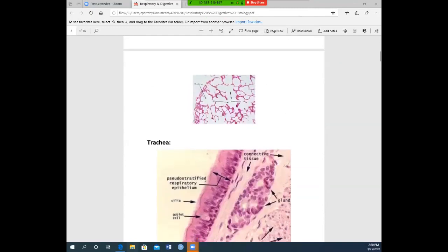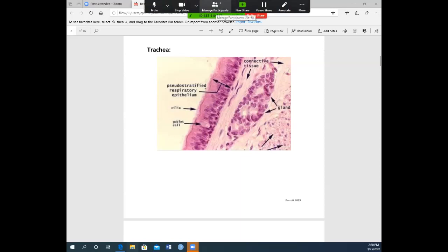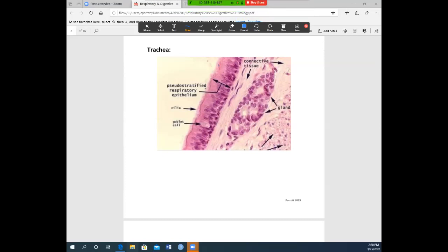Now let's go down into the trachea. The trachea is composed of pseudostratified columnar epithelium. Pseudostratified epithelium has a lot of cilia — you will see all along the top that cilia, like nose hairs in your nose. In this pseudostratified epithelium you also have goblet cells, which produce mucus.